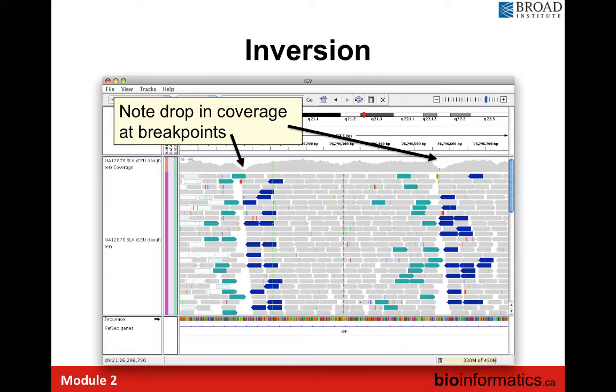Yes, so the way IGV is going to display it, you're going to load your BAM, so the alignment will have been done by your aligner that is aware of the splicing for RNA-seq, and then it's going to be displayed: you're going to have a gray box, then a line, then another gray box. So that means your read has been mapped at these two positions, but you know it's the same read. Right. So that's how IGV is going to display it. But IGV is just a visual display. It's not going to be able to map it properly. You will have to get your BAM file with an aligner that is aware of that. But yes, IGV is able to display it properly, as you would expect.